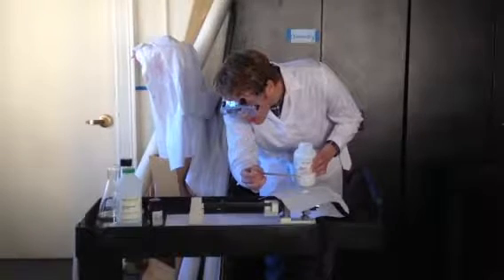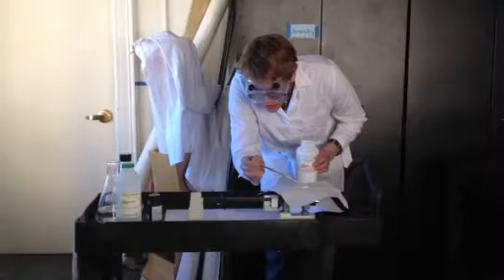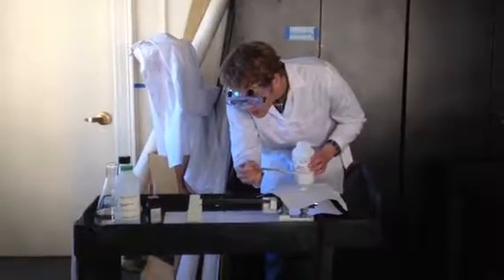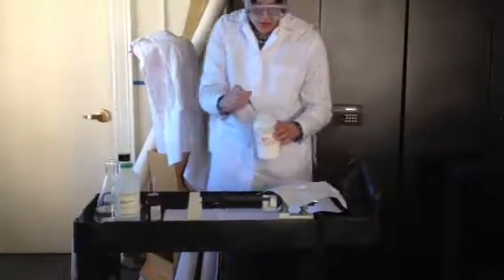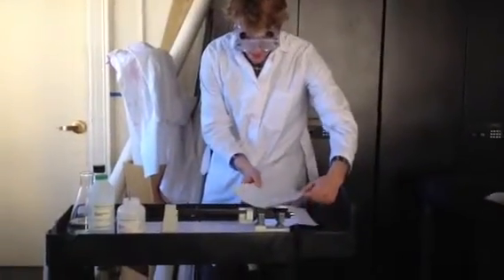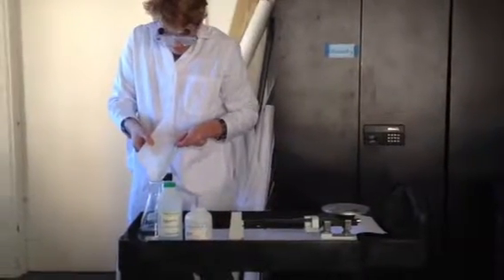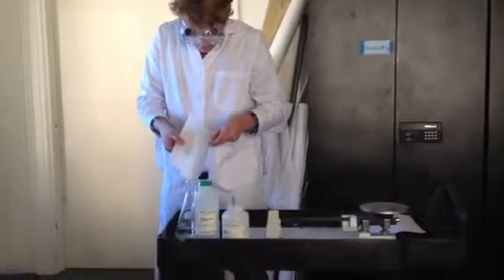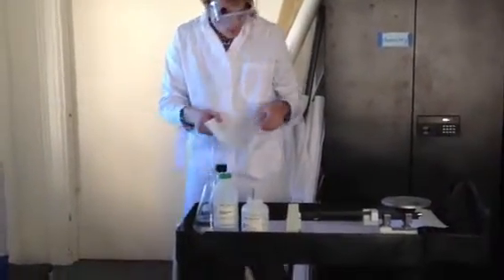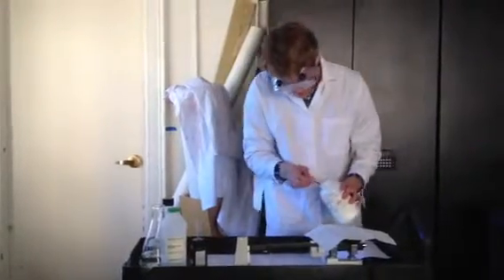Just going to measure this out. Alright. So you put 2.5 grams of dextrose into what we're going to call flask A. And we're going to take 5 grams of dextrose.